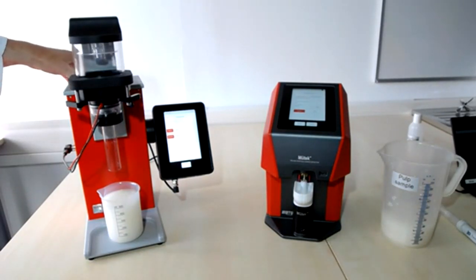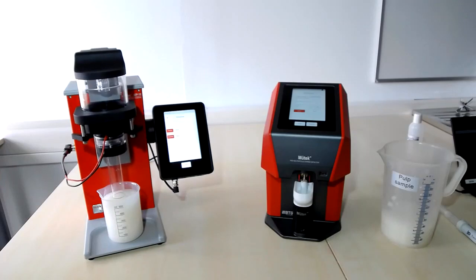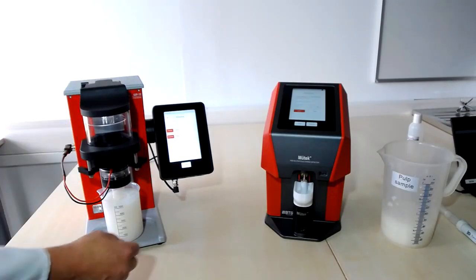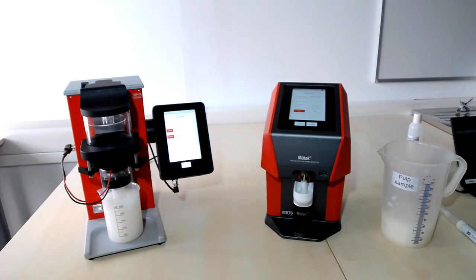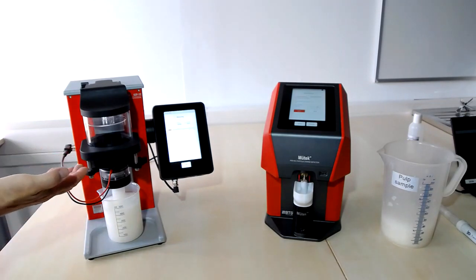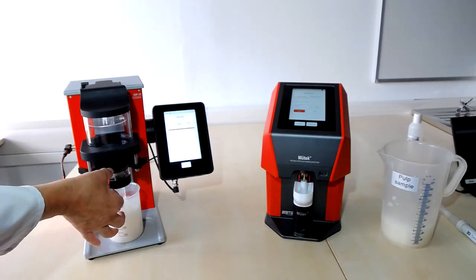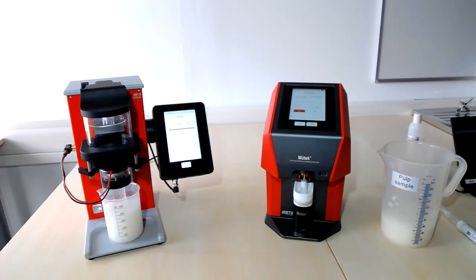Then I'm lowering the measuring cell into the suspension, and this suction tube will now dive into the suspension. And once I start the measurement, a vacuum pump will draw the fibers into the measuring cell against the screen, where these fibers remain fixed now. So there is now a sequence of just applying vacuum in order to compress the fiber plug that we have formed inside of the measuring cell.